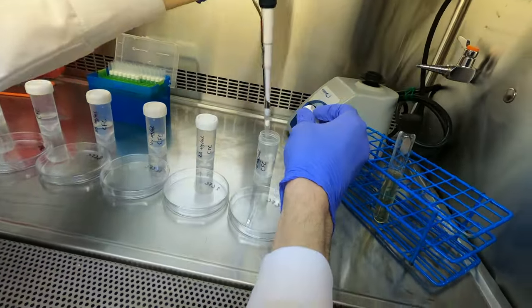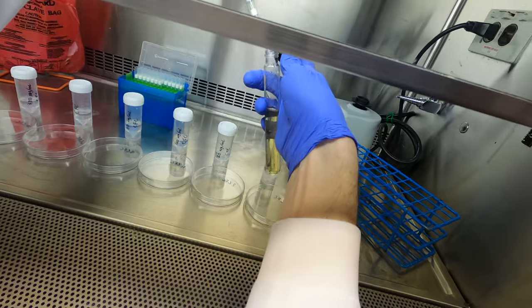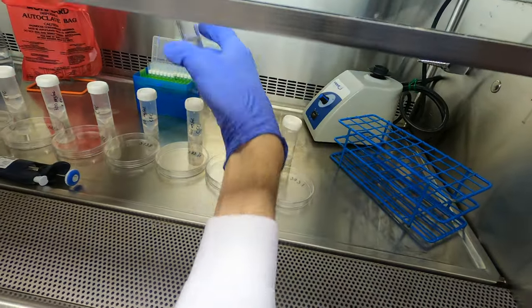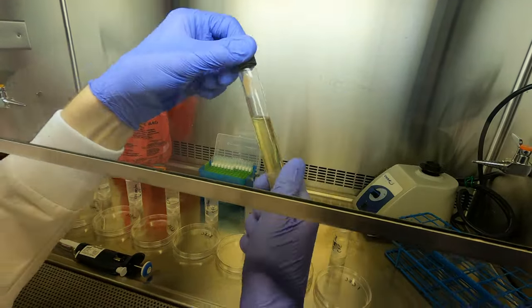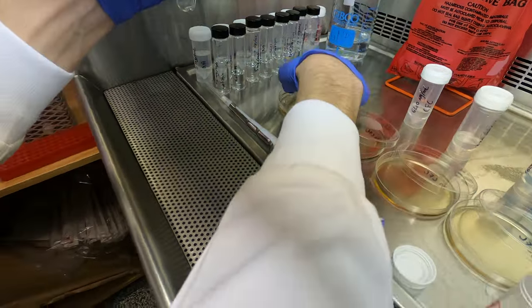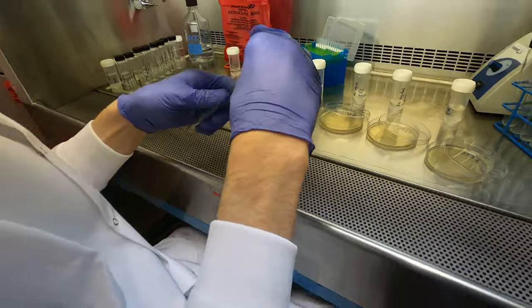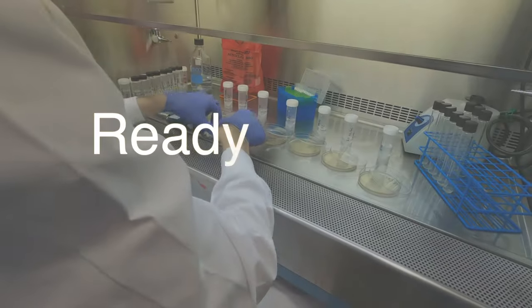Once the antibiotic has been added, we carefully invert the tube several times to mix the contents thoroughly, and then pour out the agar into a pre-labeled petri dish. Our plates are then left to solidify with the lids ajar. We do this in the biosafety cabinet to minimize the possibility of contamination.